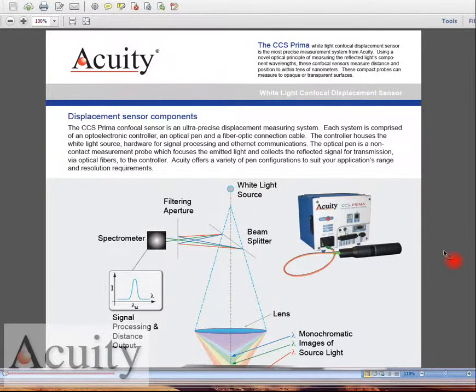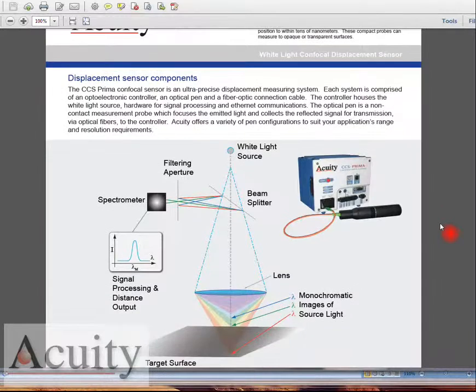In this application we're going to use the Acuity Confocal White Light Sensor to be able to measure a surface of a mouse tendon very accurately.